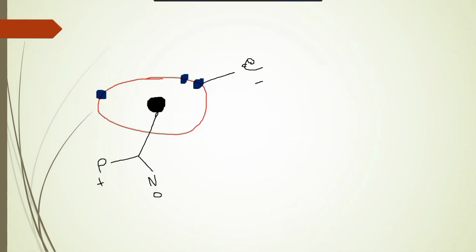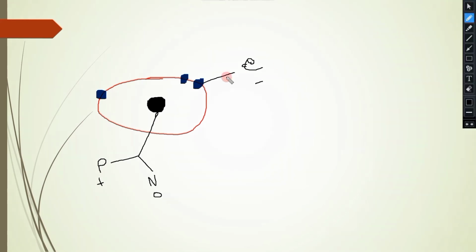In order to understand NMR spectroscopy, it is most important for us to know about the atom. So this is our atom. It has nucleus and electrons. So we know these are protons and neutrons which are present in the nucleus. There are many subatomic particles, but we are considering only proton and neutron here. So proton has positive charge, neutron is neutral, and the electron carries negative charge.